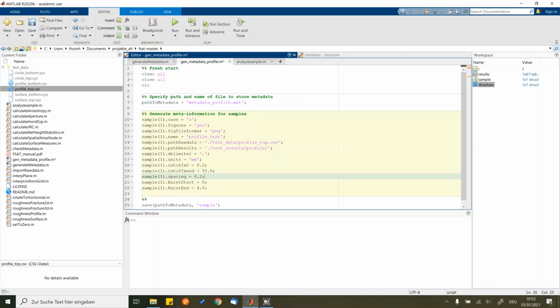Most scanner software will operate on an almost regular space grid. However, because of measurement accuracy, it's not really perfectly regular. But several roughness parameters require you to operate on regular spacing. So you need to provide the resolution of the spacing you would like to have. I recommend choosing spacing that is close to your actual scanner resolution.